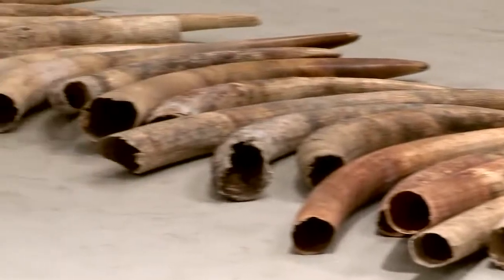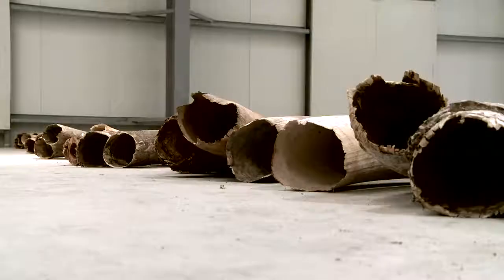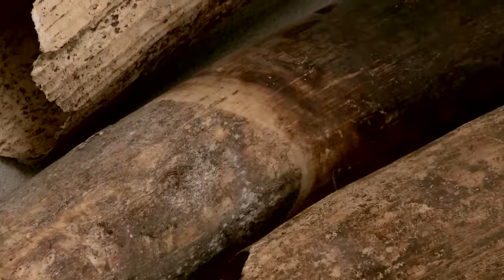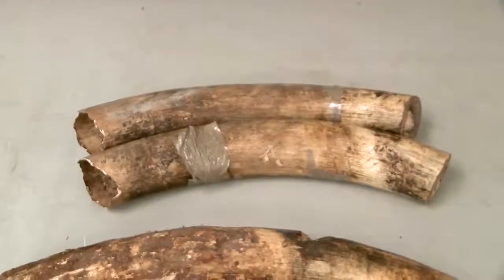For tusks cut into sections, keep only the base piece. The base is the end of the tusk closest to the jaw. Remove all other pieces of the tusk. These will not be sampled.